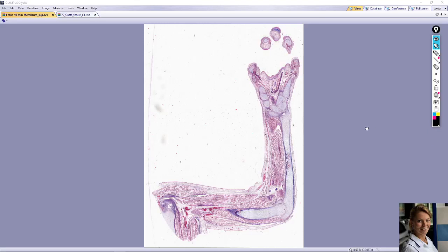In this video, we will take a look at the slides where we'll describe endochondral ossification. The first slide, which shows the developing upper limb, is stained with AZAN trichrome. That means erythrocytes and muscle tissue are red, and collagen fibers are blue. As you can see, the hyaline cartilage models with the general shape of these bones have formed already.